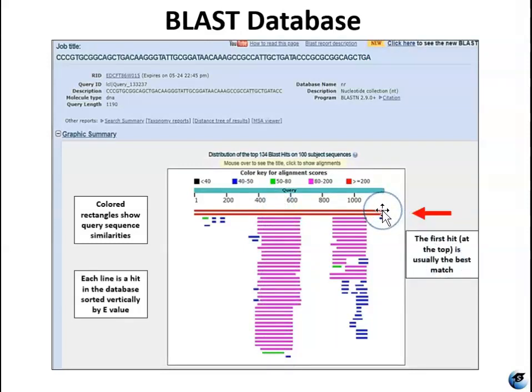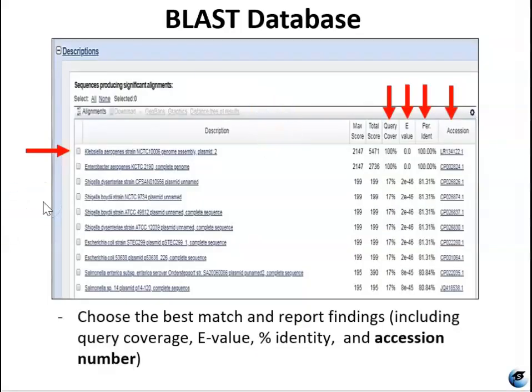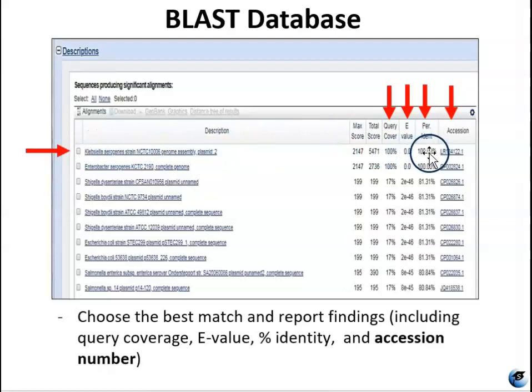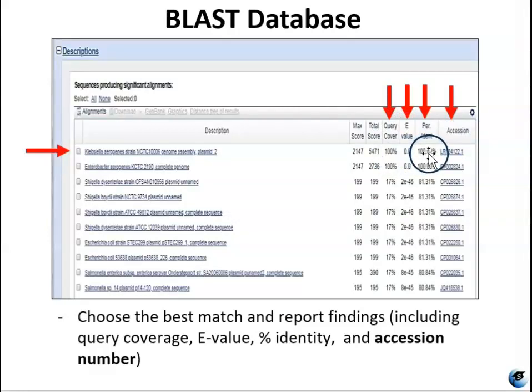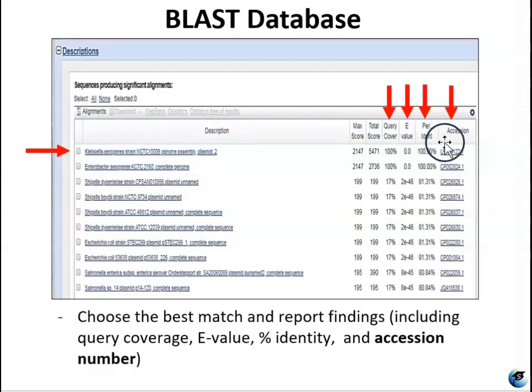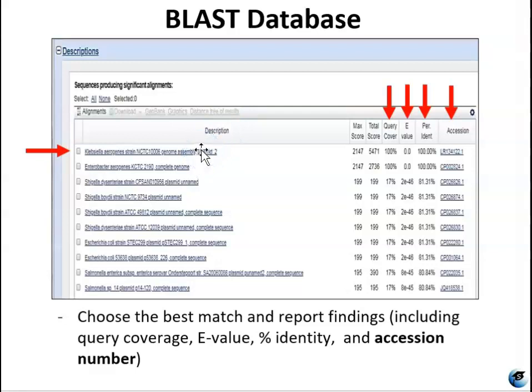On the results page, you have a graphic summary showing the similarities of your sequence to things in the database. Each line of this graph is a hit in the database — it shows the top 20 matches, and usually the first match is the one you want to go by. If you scroll down, you'll have a textual representation of the same information with some additional statistical data. The top match will show query coverage, e-value, percent identity, and an accession number. The hyperlinked results allow you to click through to find out who identified it, when, and what they were working on — somebody sequenced this, identified it, and submitted it to this database.